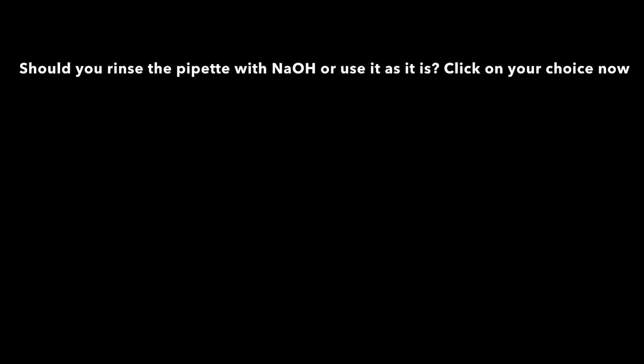Should you rinse the pipette with NaOH or use it as it is? Click on your choice now.